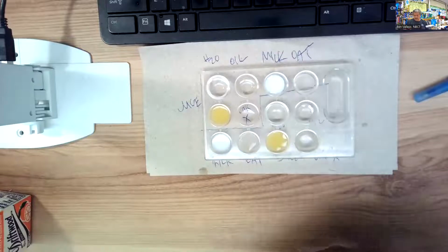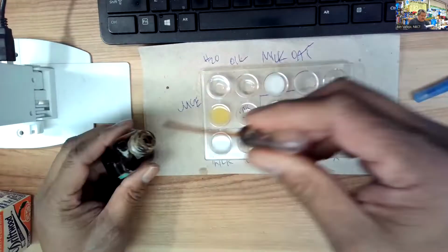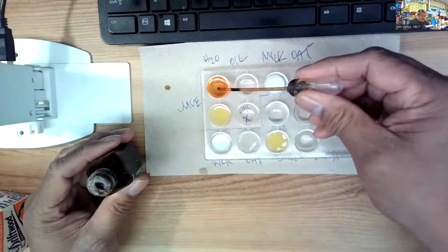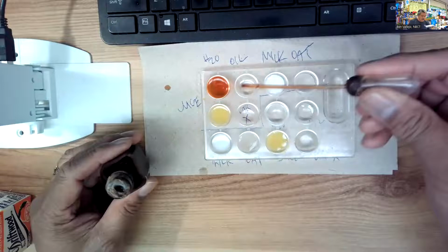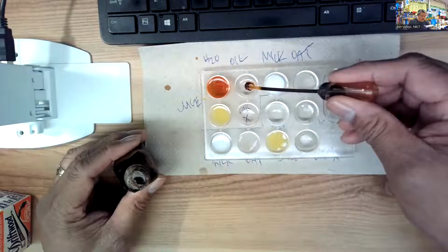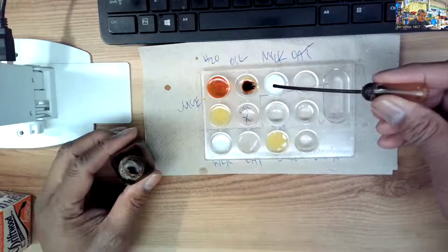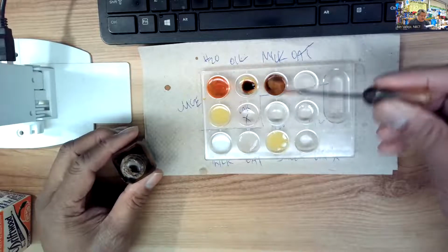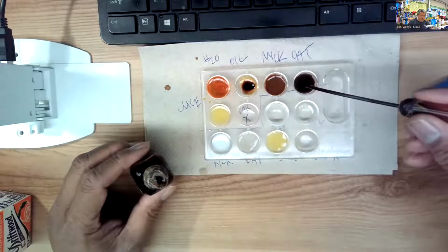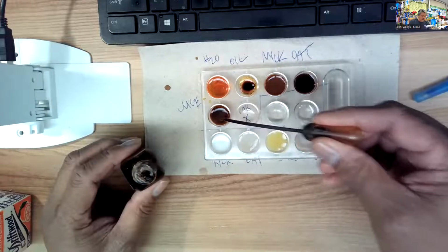So let's run the tests. We have 2 different tests. The first one is Lugol's iodine test. And 3 drops of Lugol's in each one. Here we go. 1, 2, 3. Alrighty. Oil. 1, 2, 3, 4. This is qualitative, so it doesn't matter that I have an extra drop in there. 2, 3. There's the milk. There's the oatmeal. 1, 2, 3. There's juice. 1, 2, 3.